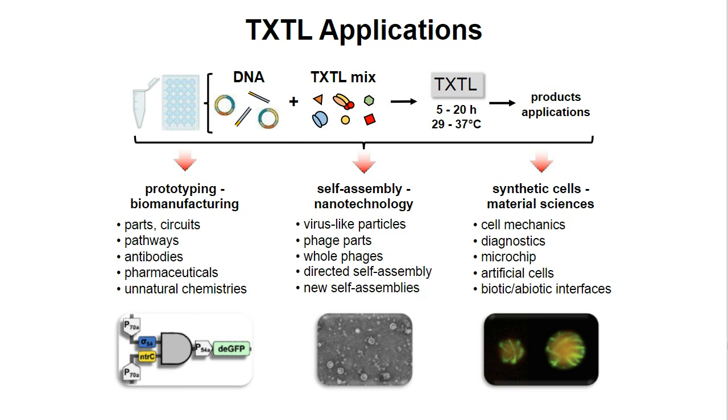With this system and TXTL, you can study cell mechanics, you can develop diagnostics, you can develop microchips, you can build artificial cells by incorporating non-natural molecules, and you can develop biotic-abiotic interfaces.